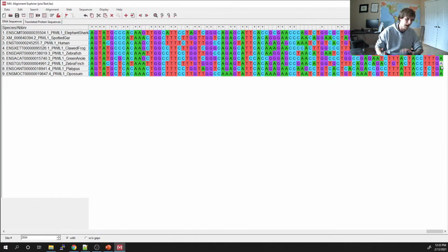Now we're going to get rid of gaps. In phylogenetics, we really can't model gaps very well. We can model substitution changes, but we really can't model gaps. So most gap sites are already eliminated before we do phylogenetics. If they're not, they're typically removed. But nonetheless, whenever we bootstrap, we're going to take this raw data and repeatedly sample from it to make a new alignment.